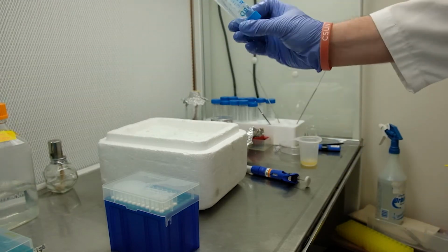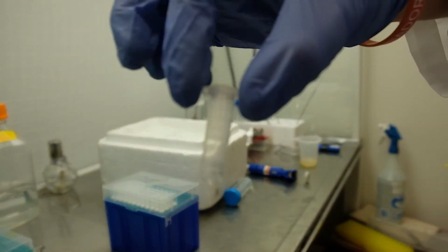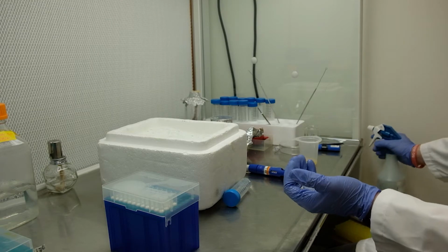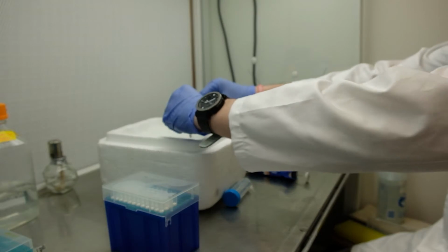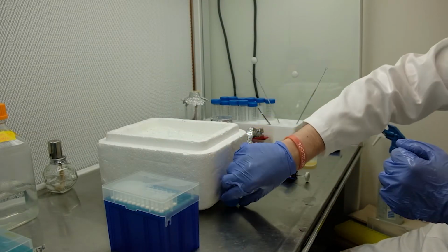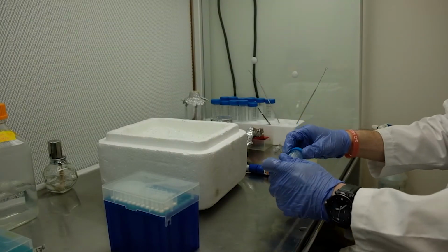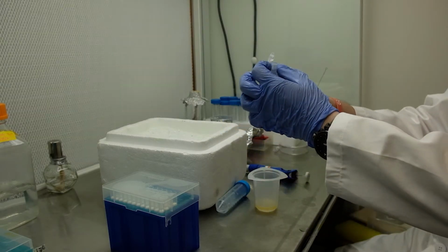If it's frozen, let it thaw at room temperature. Also prepare a cryoculture tube. They look like this with a different kind of bottom. Get your samples from the centrifuge. Make sure your glycerol and calcium chloride solution is in a liquid state. Now discard the calcium chloride supernatant just like you did before.